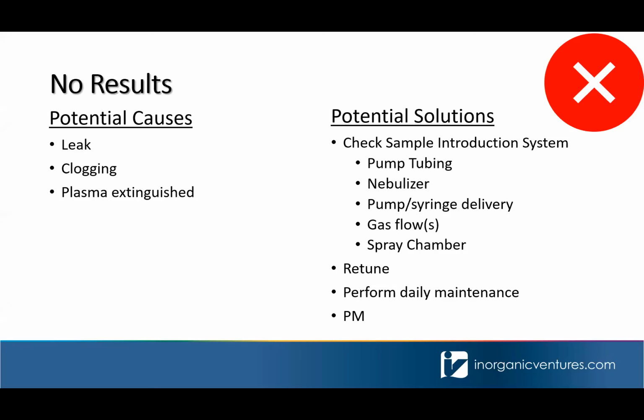Another cause of subpar instrument performance could be issues with the gas flow. We saw on the other side, in your tuning, to make sure that your gas flows are appropriate. That's your nebulizer and your plasma gas flows and any tubing associated with those components. We recommend running a retune if you're having issues with your results not coming out properly.